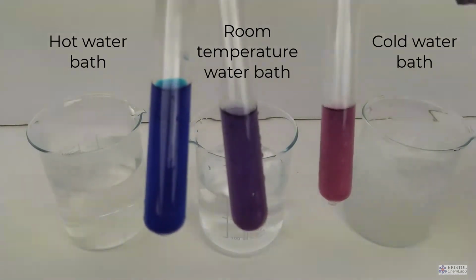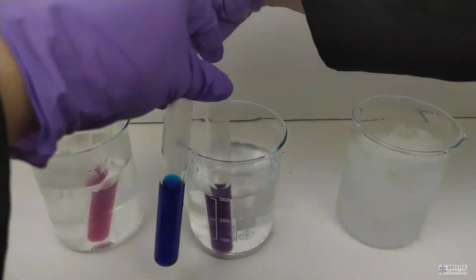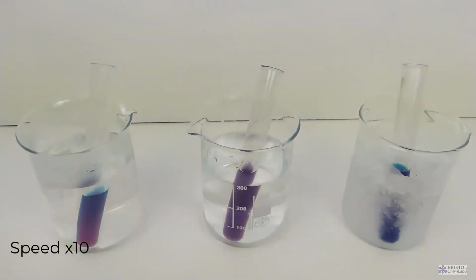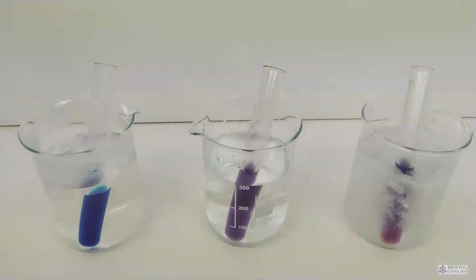Hydrated cobalt 2+ ions are pink, while the cobalt surrounded by 4 chloride ligands is blue. The reason that at room temperature the solution appears purple is there's a mixture of both complexes present. Not necessarily 50-50. Red plus blue equals purple.